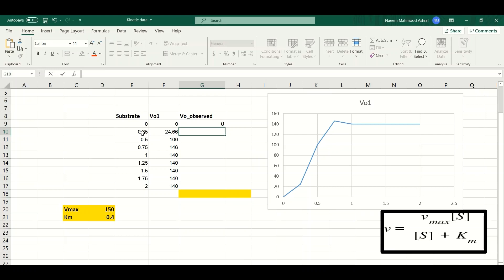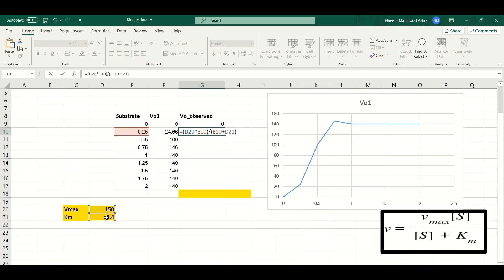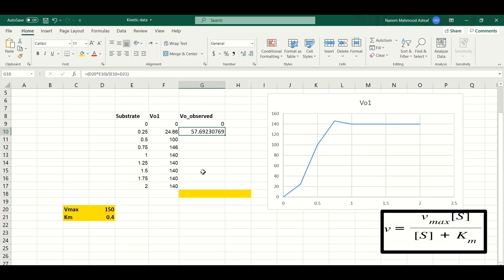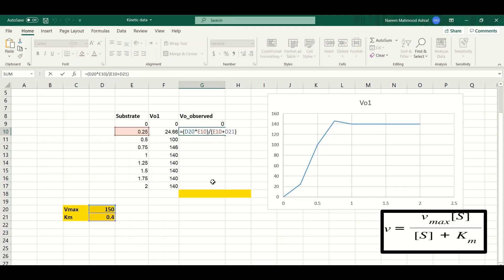We will use the Michaelis-Menten equation formula in Excel. The formula is: equals sign, open parenthesis, Vmax value multiplied by substrate concentration, close parenthesis, divided by open parenthesis, substrate concentration plus Km value, close parenthesis. To make things easy, we put a dollar sign between D and 20 — the Vmax value — and D and 21 — the Km value — to anchor those cell references.